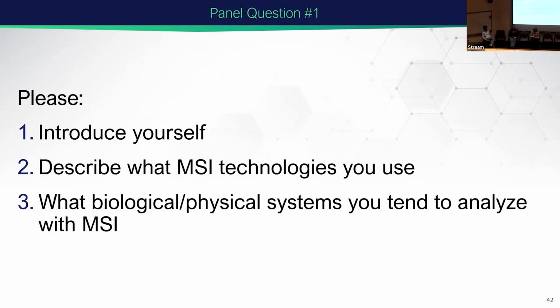My name is John Cliff. I've been told that I was the first external user ever at EMSL. And at the time I was studying nitrogen cycling in soils. And I was the first person to put an in situ silicon chip in soil. And I analyzed it with TOF-SIMS here at EMSL. And because I'd actually touched a SIMS instrument, I was hired on at National Security here in 2004 to try and estimate how much plutonium certain countries were making. And I can't tell you what countries those are.